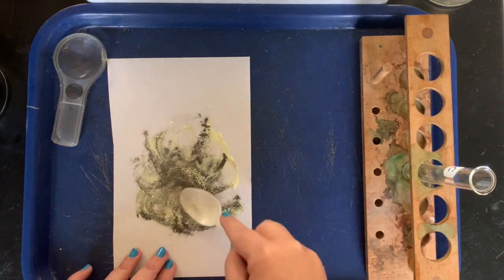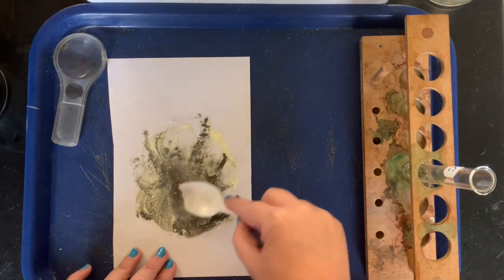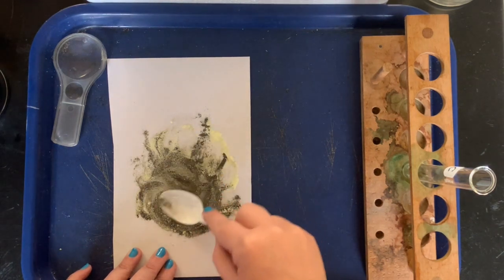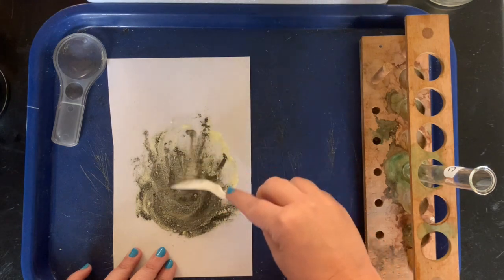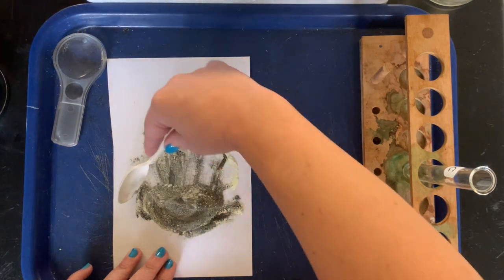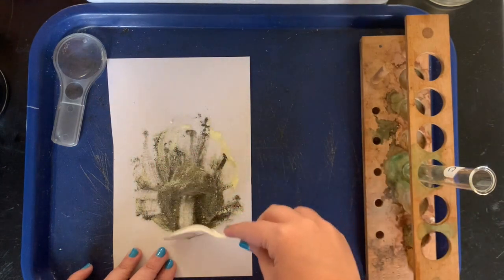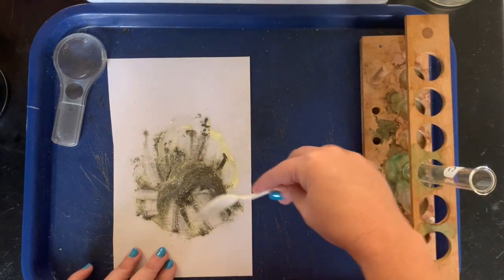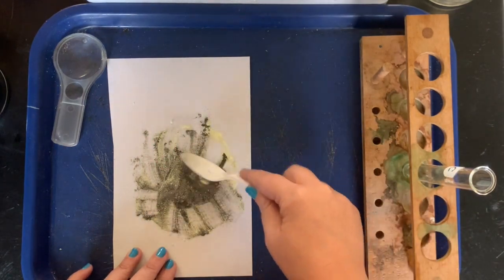And you can start to notice there is a little bit of a color change, but that's expected. Yeah, it's more like, you know, if you mix black and white paint and you got gray, this is like mixing a dark brown and a light yellow, so we're gonna get kind of a gray.